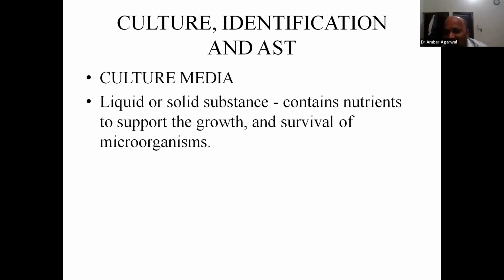It means that the tellurite conversion has taken place, and when you make a gram stain from it, you can see gram-positive bacilli, and the Albert stain becomes positive. So here is why you need to do a culture, because the gram stain sensitivity is less. And from that culture, when you isolate the pure colonies, you can go for antibiotic sensitivity and say which antibiotic to give.